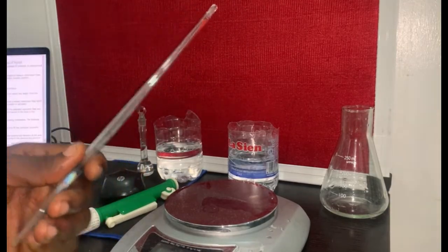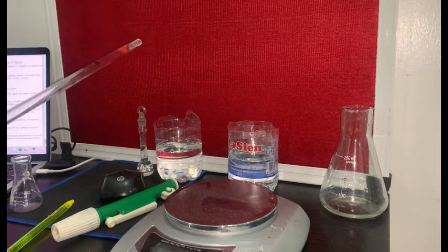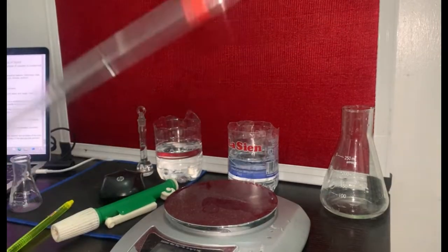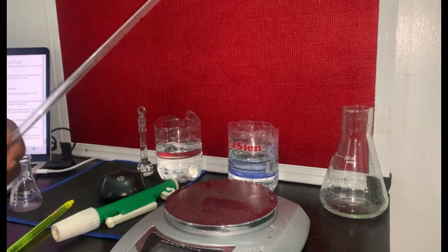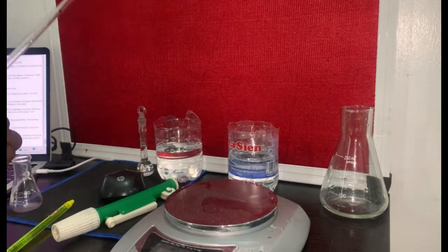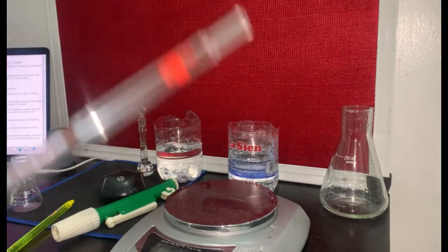But what if, since it is the average that I'm going to record, you may not really have enough time in the lab, so you can just take one of this, because if you take one of this, it is 5. If you take 5 of this and divide by 5, it's going to give you something approximately equal to 5. So instead of going through the stress of doing this 5 times and then taking the average, you can just do 1. Maybe if you want to, you can do 2, depending. If they give you a 10 mil pipette in the lab, you can do 2 and divide by 2.